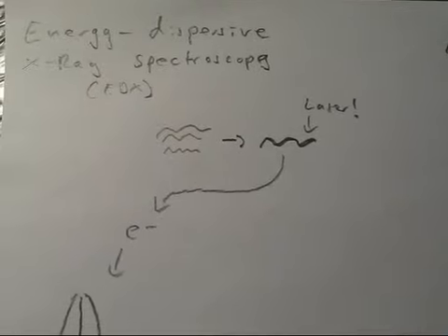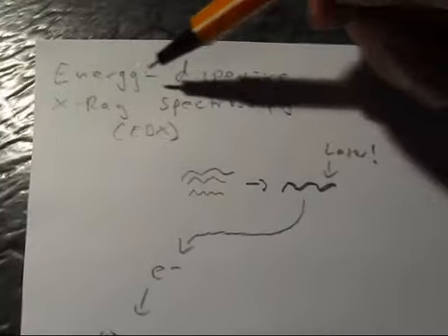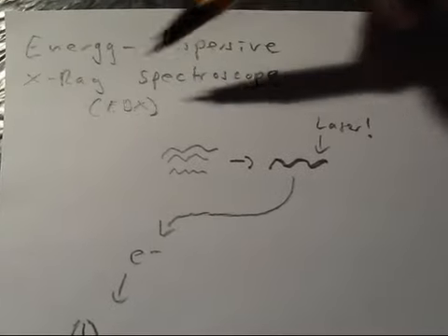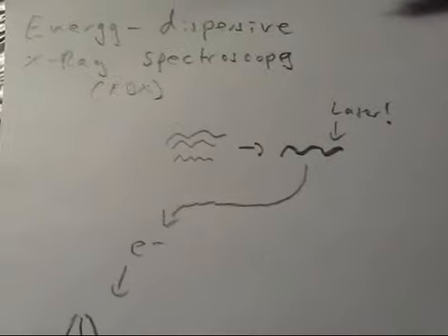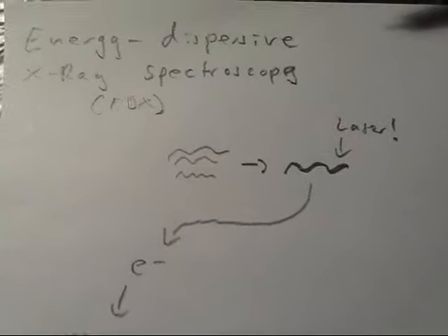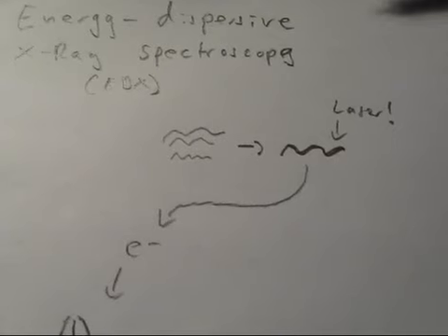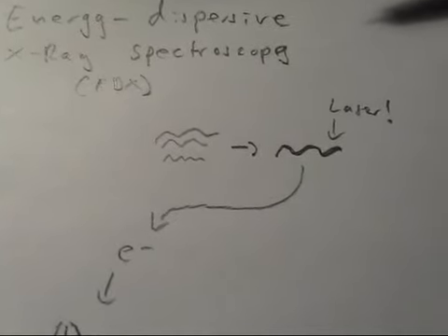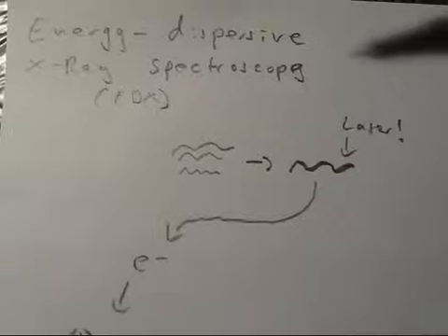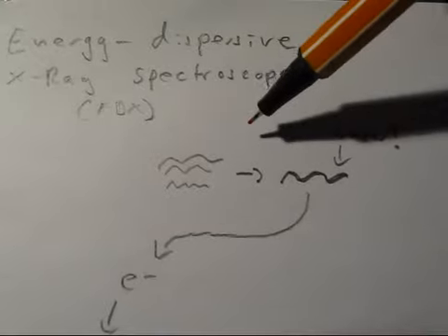Okay, so I just had some of my minerals analyzed in an electron microscope by means of energy dispersive X-ray spectroscopy. I actually wanted to draw this on the fly as I was talking and explaining stuff to you, but I found out I can't really multitask, so I can't really talk while drawing. And also my motor skills are pretty horrible, so it all looked like the drawings of a 3-year-old and you couldn't make out anything. So I actually had to do this in advance. Sorry about that. So anyway, about electron microscopy.